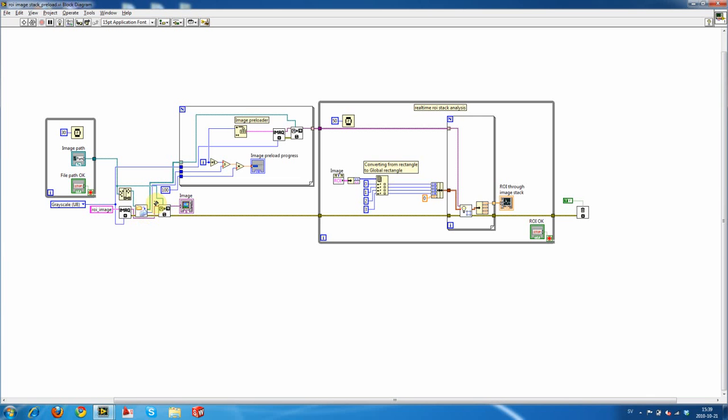Different to what happened previously is that we now have our while loop away from our image analysis loop. So what it's doing is reading this list of files into here, and we're then making space in the memory for these files. So this is take the file, put it into the image, and just like in the previous for loop, we're making a big array of all these data. So we have an indexed item here. It's just making a big list of where all these images are.